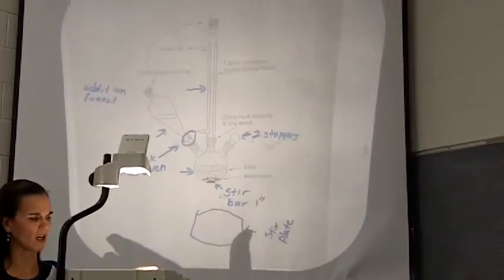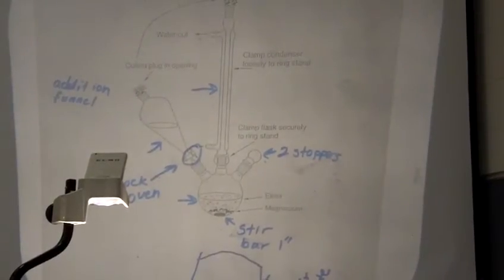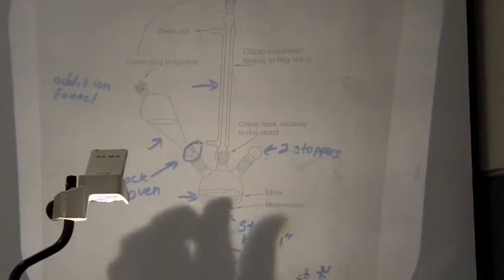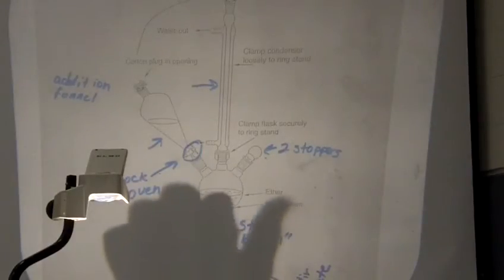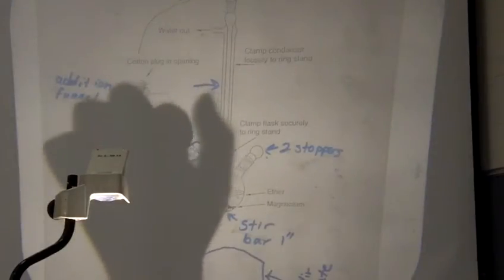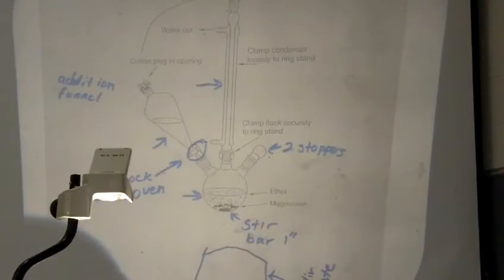And so we have to take some care with that apparatus. We talked about what glassware you needed to have clean and dry for lab this week. It was your 3-neck round bottom flask with its stir bar. You needed 2 glass stoppers, the separatory funnel without its Teflon pieces in it, and your Liebig condenser, okay? You won't be able to clean any of your glassware this week.